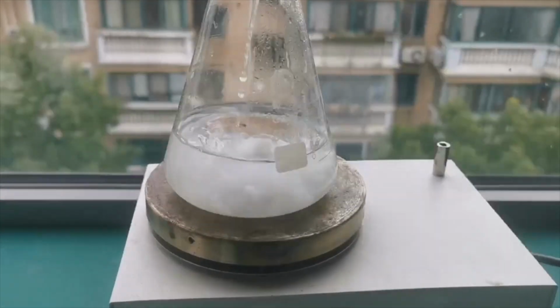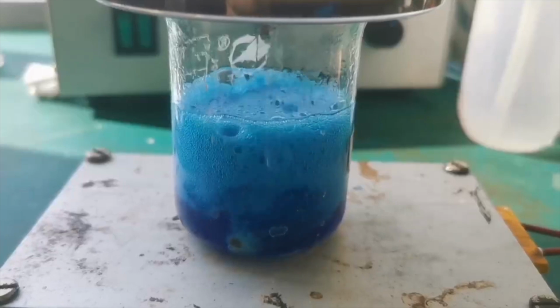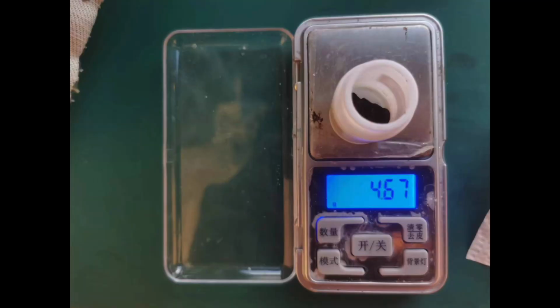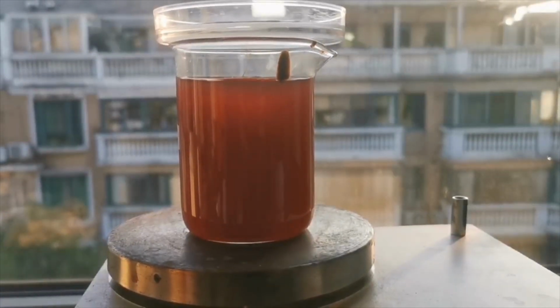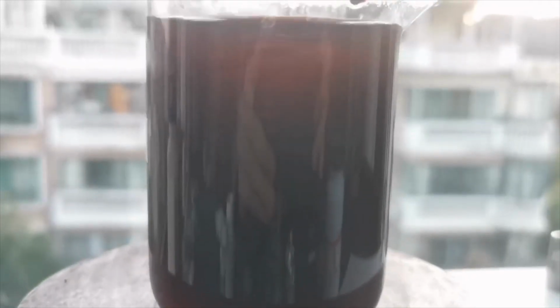made some hydrochloric acid and added 40 ml of it to the magnet. The reaction looks exactly the same as before, so I won't bother you with the details. All you need to know is that even after this, 4 grams of the magnet is still not reacting, so I gave up and stored it. I'm really tired by this point and didn't bother to remove the lanthanides from the solution, so I directly combined it with the rest of the cobalt chloride solution.